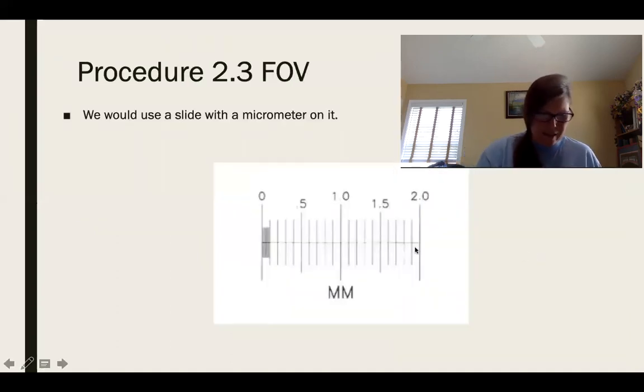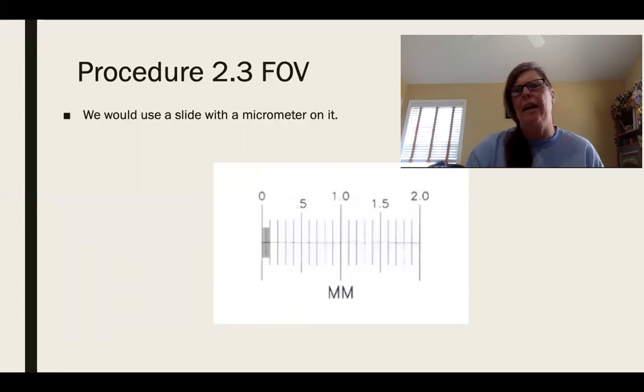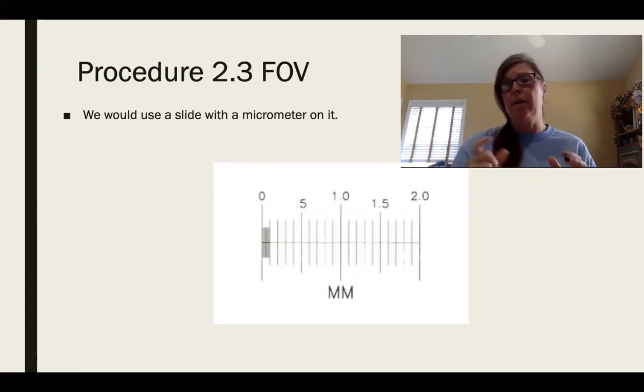All right, now the last question here, number 3, you will notice that on your virtual, they'll actually talk about that in one of the virtual programs, and that as you magnify up, your light intensity tends to go down. So the background light gets dimmer. So there are 2 ways you can correct for this. On the base of your microscope, you have what is called a rheostat. It's kind of like a dimmer switch. So you can turn the brightness up or down.